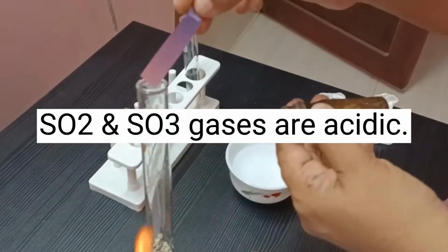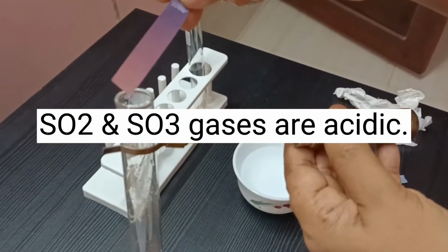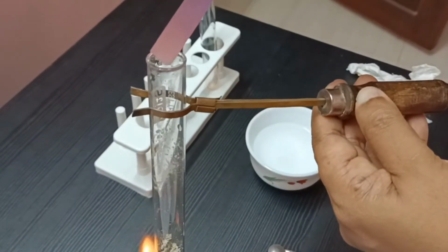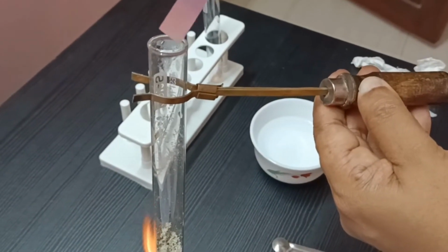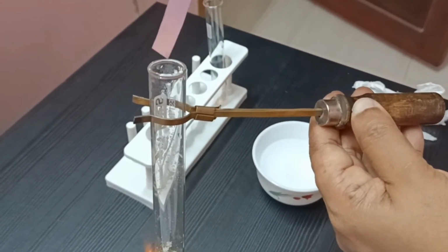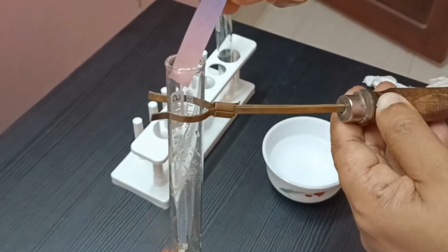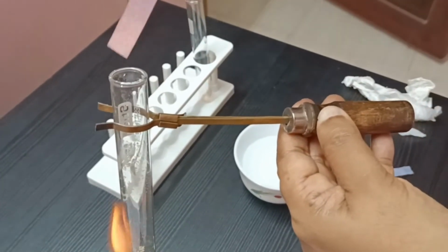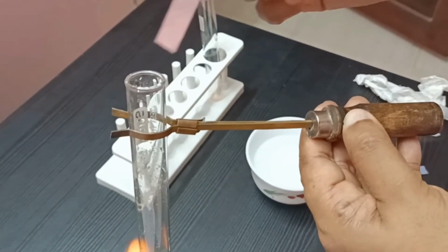That means sulfur dioxide and sulfur trioxide gases are acidic in nature. We cannot identify the gases from their color, but from the smell we can identify, because there is a strong stench of burning sulfur.